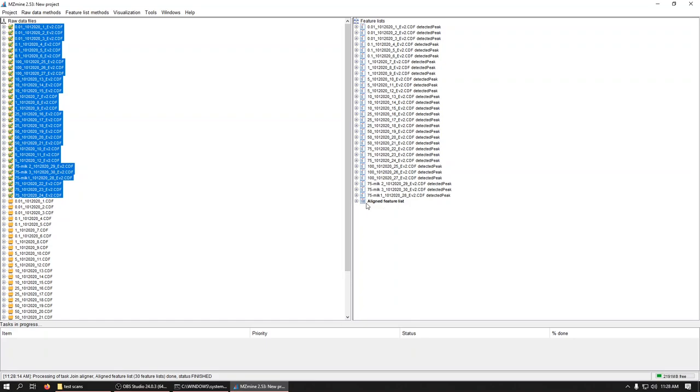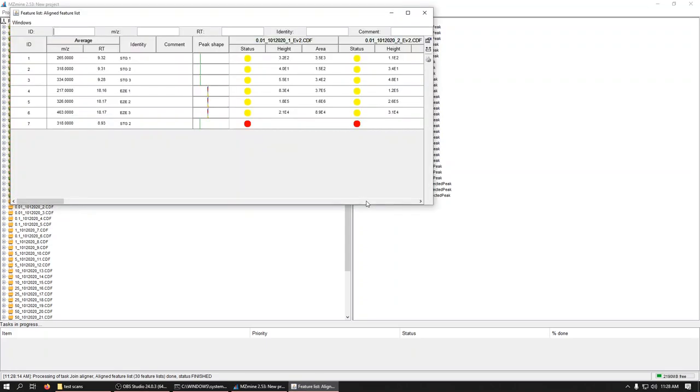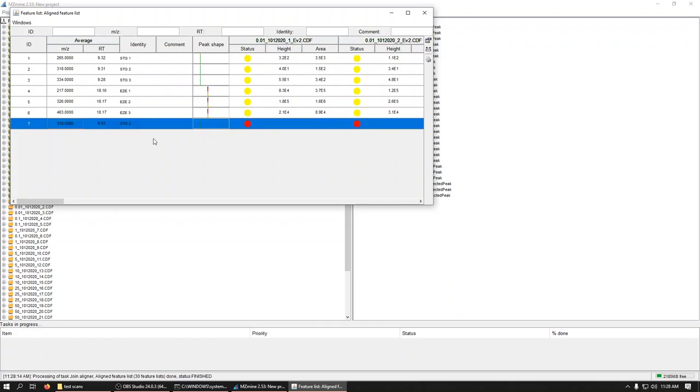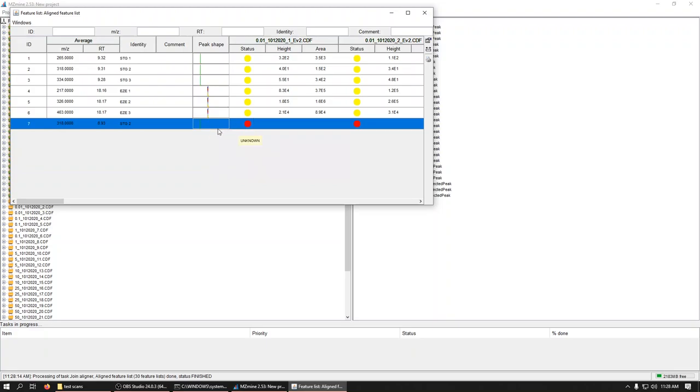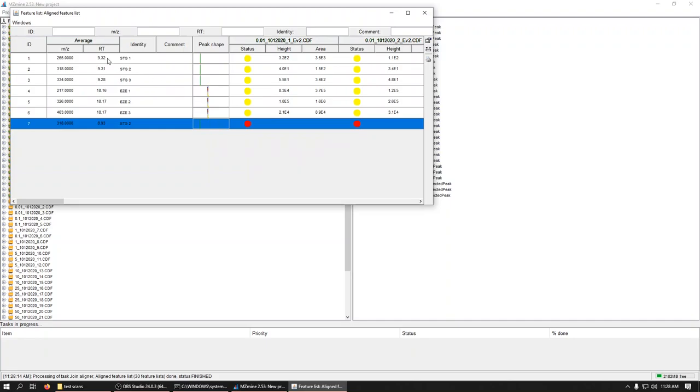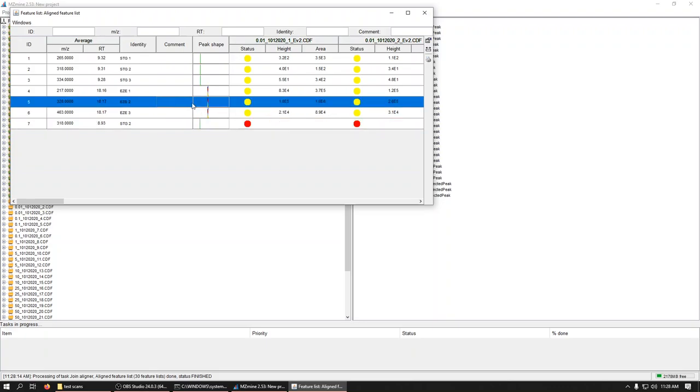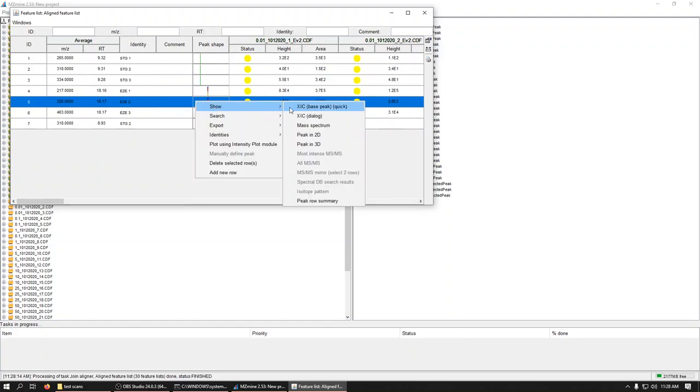So what that did is that aligned them all. So it said, hey, within these windows it'd be the same. So if we open this up, we can see this guy right here. This is actually, if we point, we can see the data file involved. And that's one of our low standards. And we're really pushing the limit of detection on this method. So I'm not surprised it said this isn't the same. You can see its retention time is 8.9 when the rest of them are sitting around 9.3.